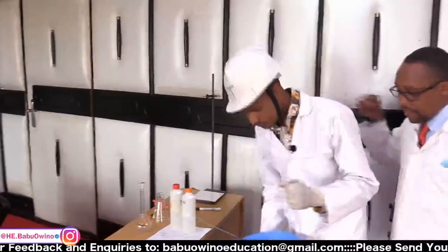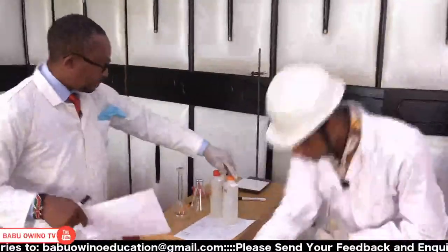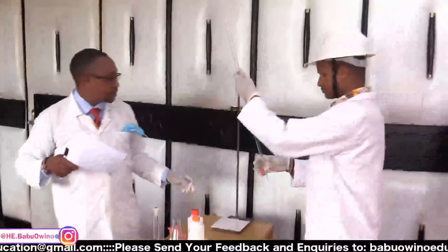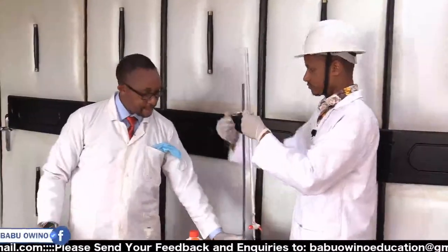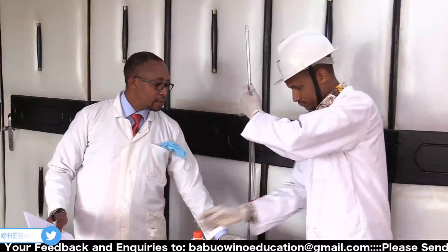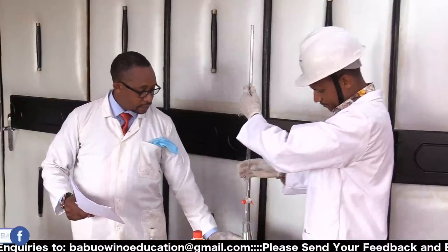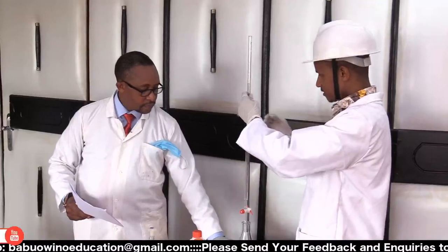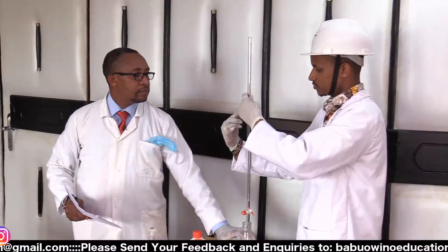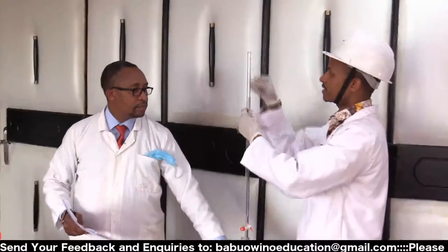He will put the acid, and the acid in this case is HCl. First, he clamps the burette. Let us see how it should be done. Remind them the graduation's facing you. So you place your conical flask, then place your burette just slightly at the tip of the conical flask. Then the graduation should face you as you are doing your practical. The graduation on the burette. Graduations are the marks, the markings.